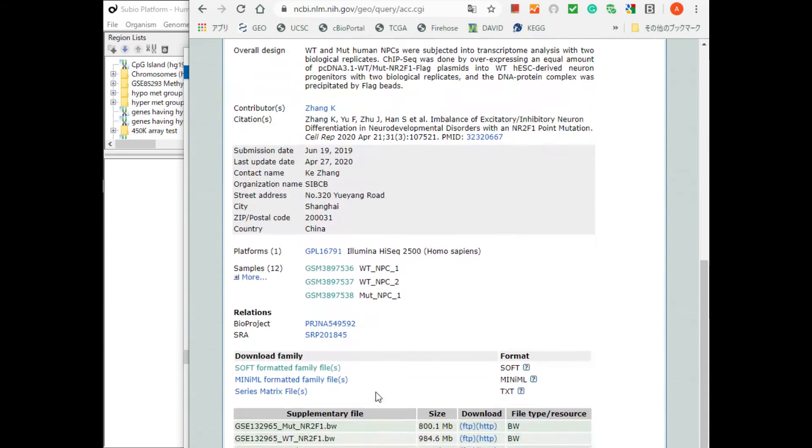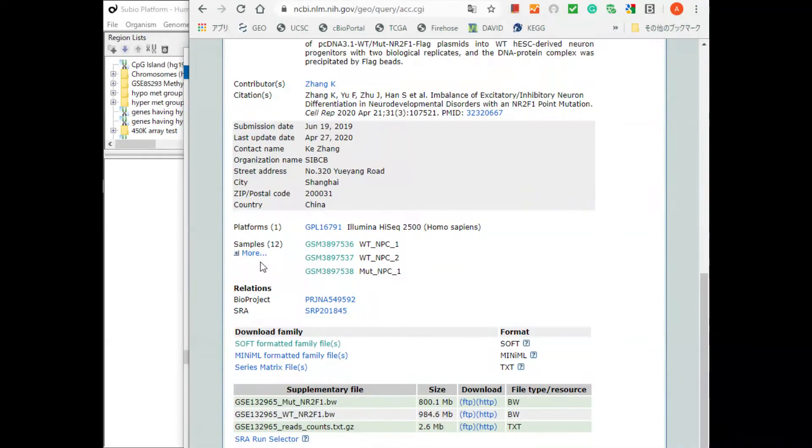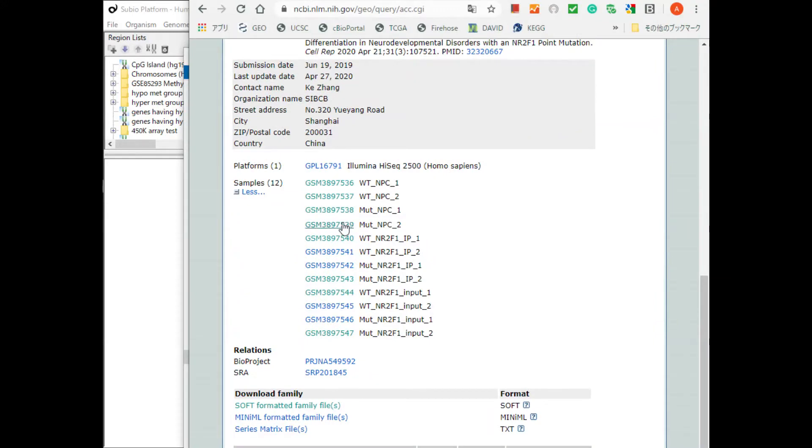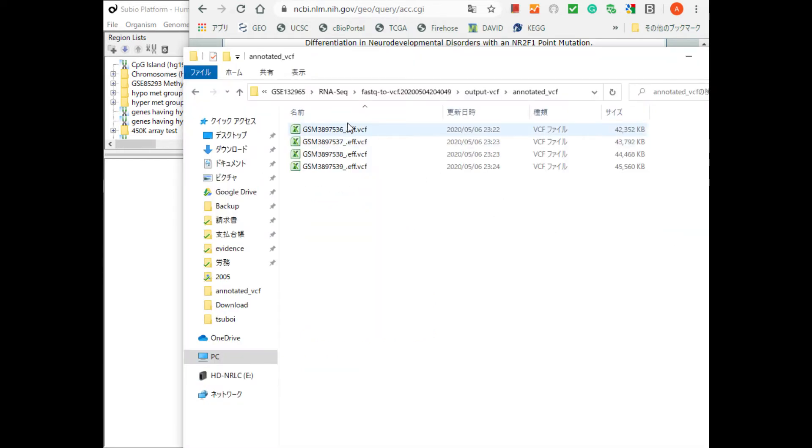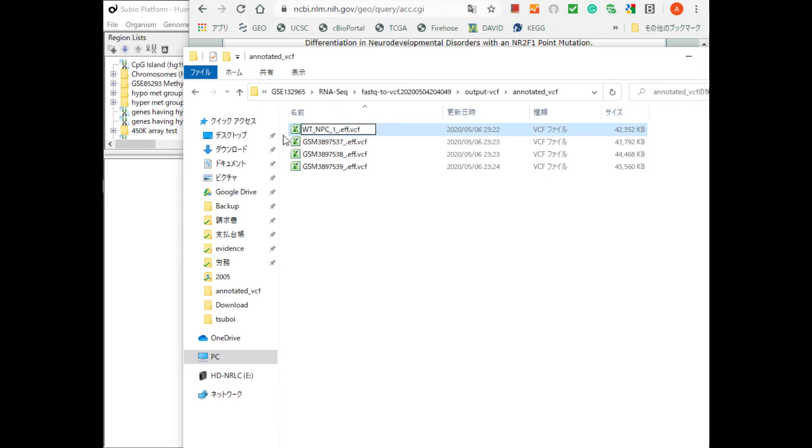GSE132965 is the experimental data that investigated the effect of point mutation on the NR2F1 gene. Change the name of the file to make it easier to understand whether it is WT or mutant.